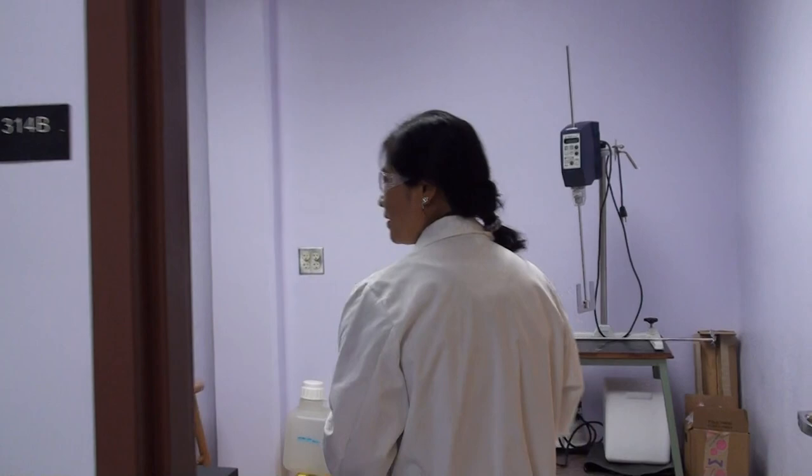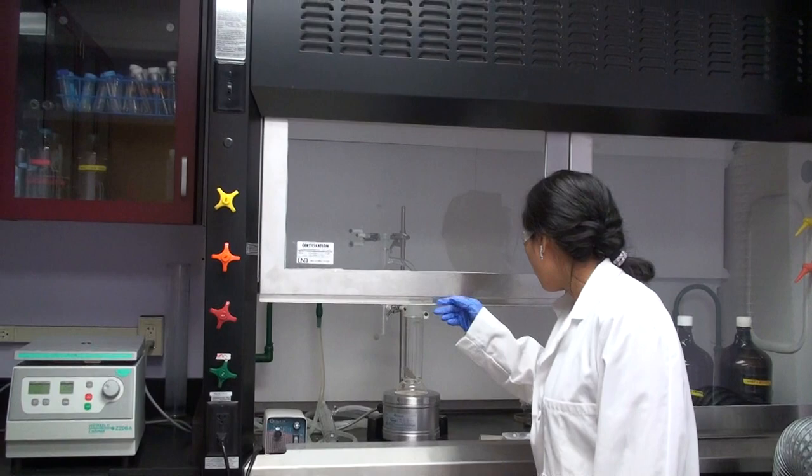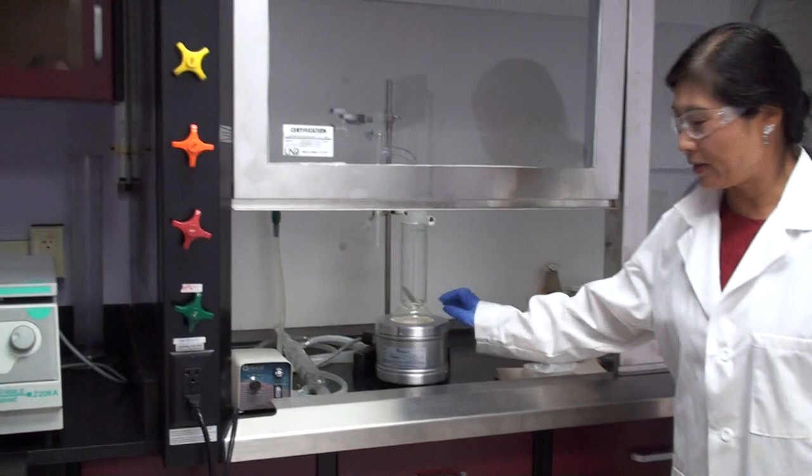The very important thing here, we have a big fume hood. This one can be used for some chemical storage. You see the chemicals over there, and we use the small Soxhlet to clean core samples.